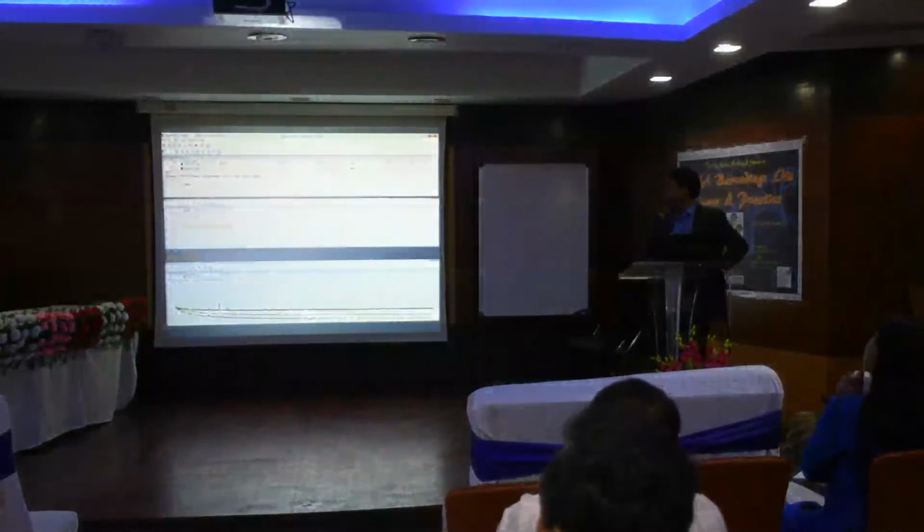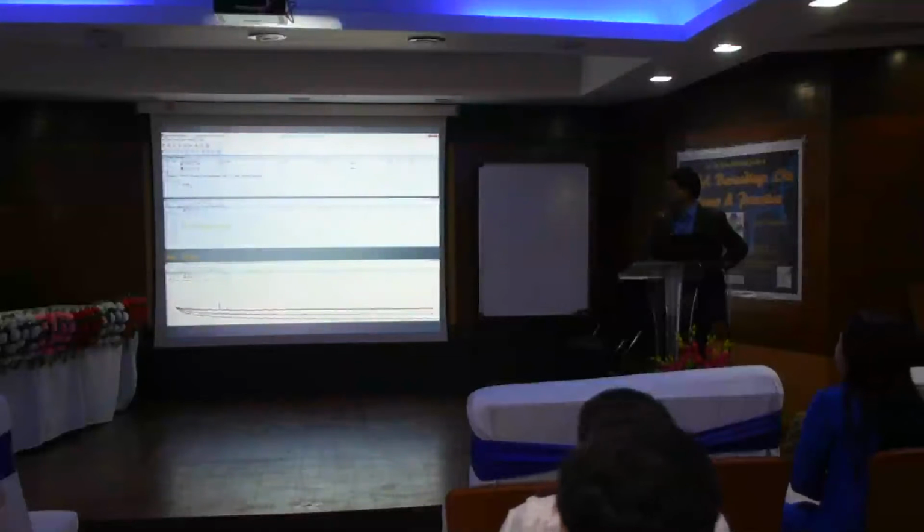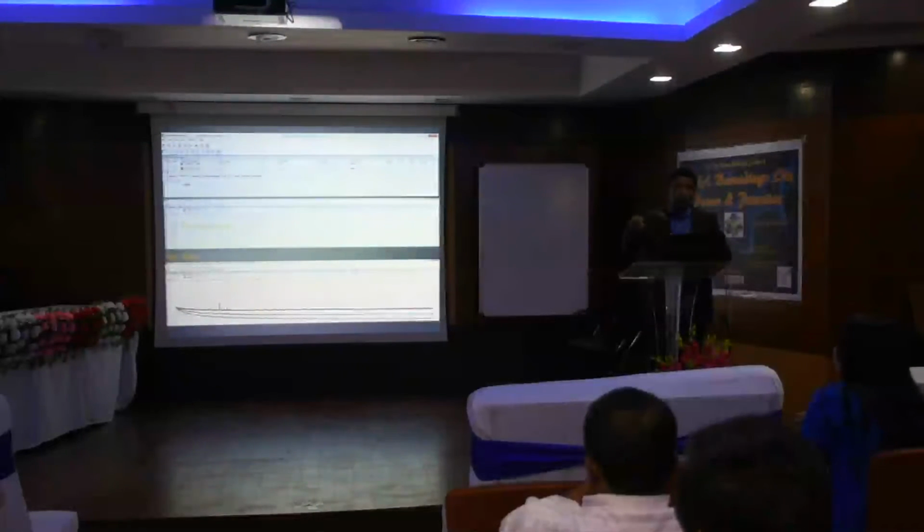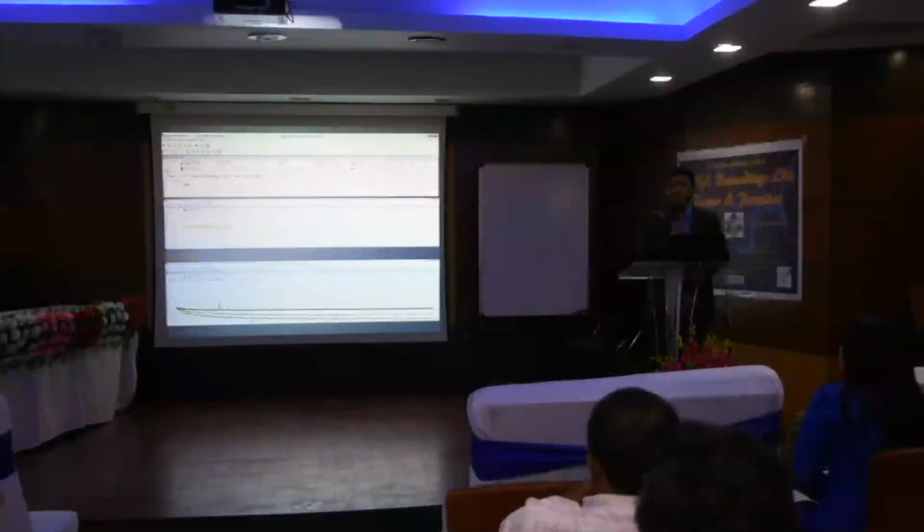Then, typically, you can have such QC values and electropherograms. I think this is not of interest to everyone, but I am showing you just to add to your knowledge. In your sequencing sometimes you will get N. When you have this N, that means you have a lot of salt concentration in your PCR, or maybe a lot of dimers, or maybe the template quality you used for sequencing is so poor. In some cases you don't get anything, and in some cases you will get this. This is typically associated with high salt concentration in the PCR reaction.